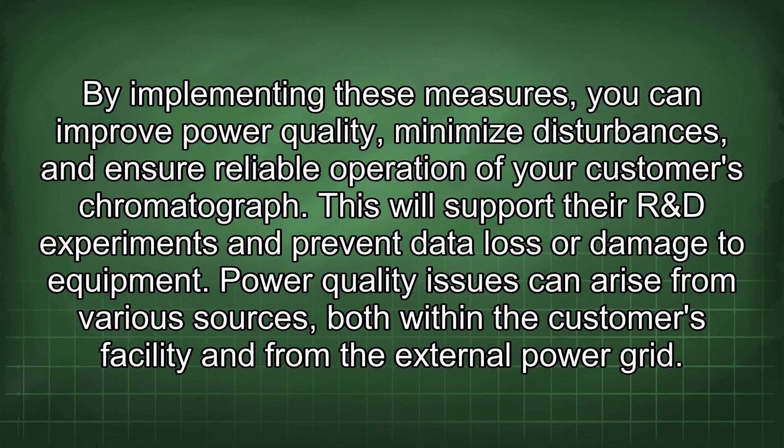By implementing these measures, you can improve power quality, minimize disturbances, and ensure reliable operation of your customer's chromatograph. This will support their R&D experiments and prevent data loss or damage to equipment.